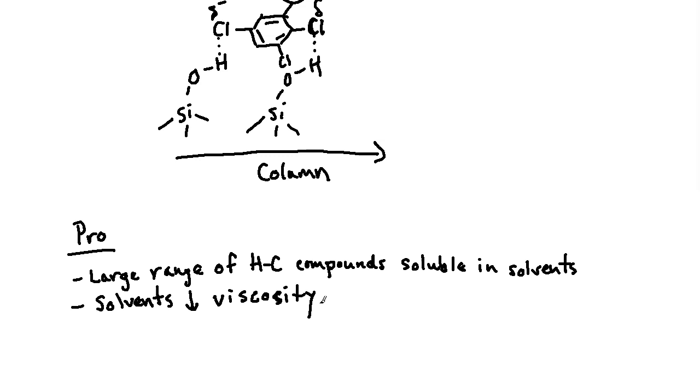But even within that, if you start looking at hexane and ethyl acetate, a lot of the ethers, the hexanes, they are not as viscous as water and the alcohols. And that's because they don't have the same intermolecular forces that bind them together or glue them together. And so when you get those weaker intermolecular forces, the viscosity goes down, meaning it's more free-flowing and it doesn't plug up as easily.